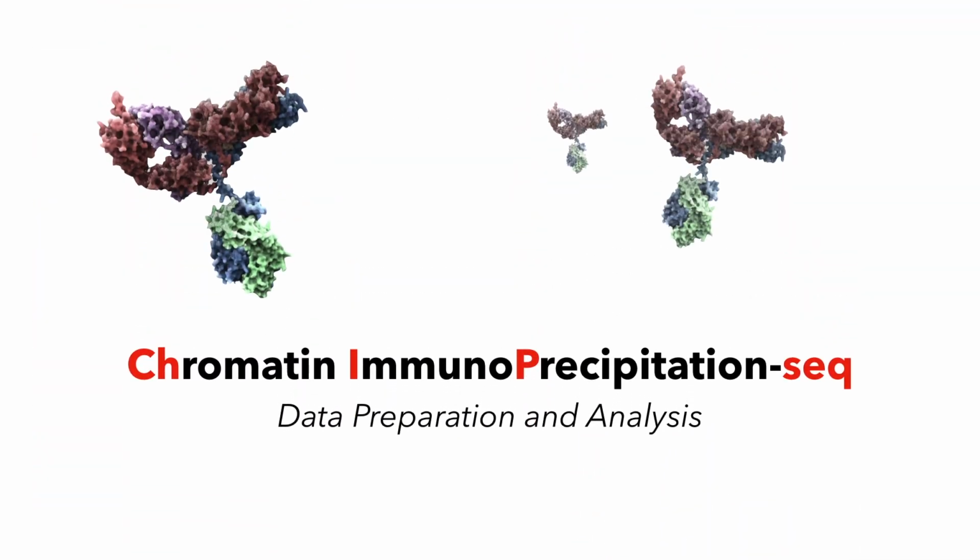Chromatin immunoprecipitation followed by high-throughput sequencing, or ChIP-seq, is a powerful tool to identify genome-wide profiles of transcription factor binding sites, histone modifications, and nucleosome positioning. To understand the way this data is generated, we have to look at the process in greater detail and appreciate the biological elements involved in various steps of the ChIP-seq protocol.